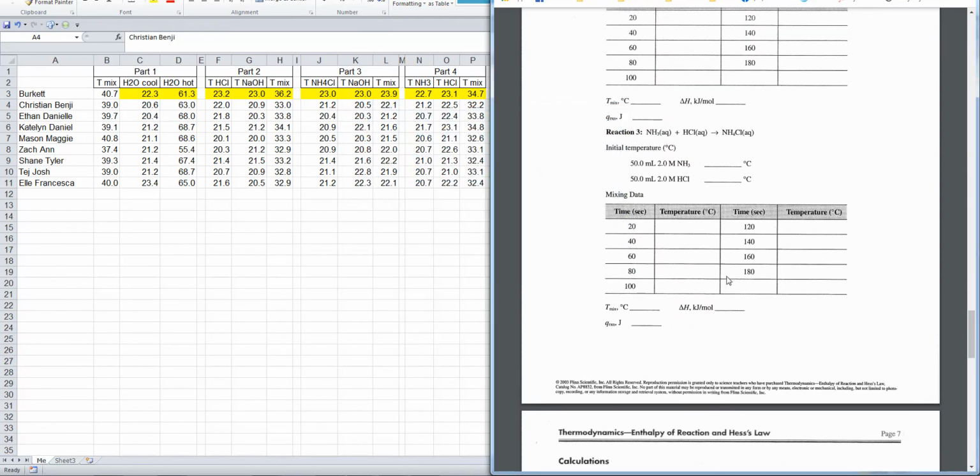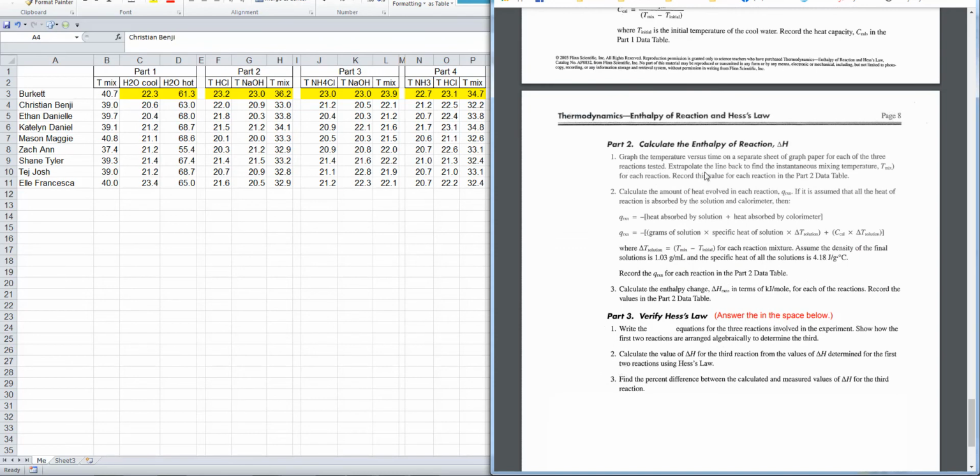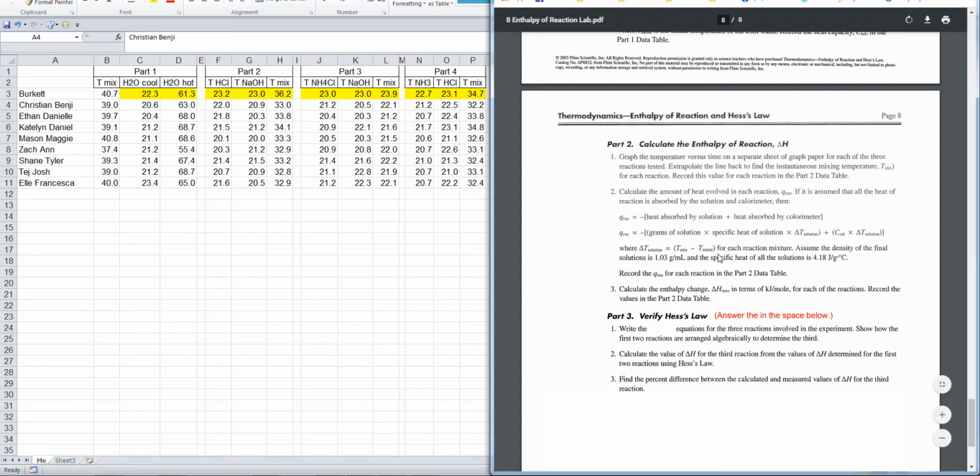So if we go down to these calculations, right down here, where it says T-mix minus initial, these two temperatures should be fairly close. For this T initial, you're going to use the average of the two solution temperatures. For instance, if I looked at Christian and Benji's data, they have 22 degrees for the hydrochloric acid and 20.9 for the sodium hydroxide. They would take the average of these two for this T initial. It's not hot or cold anymore because we just have an initial temperature, but it should be the same temperature, so I would just take the average of those two. And then the T-mix, obviously, I've given to you again.